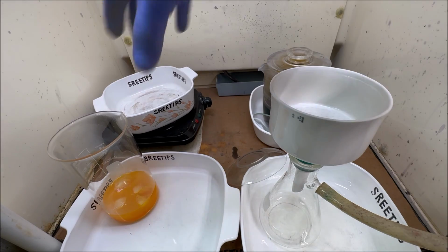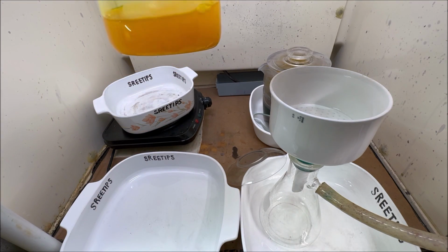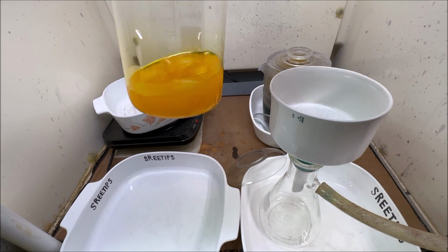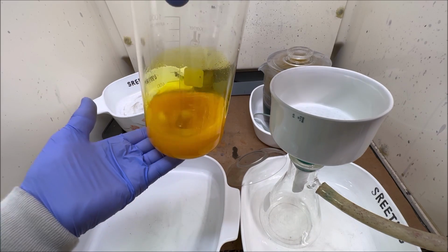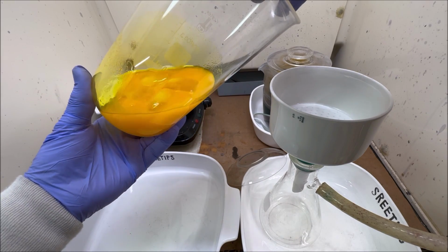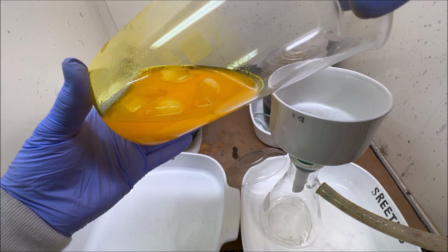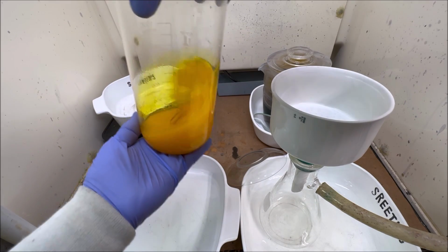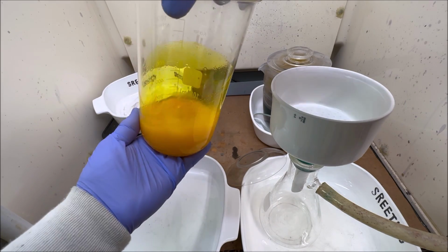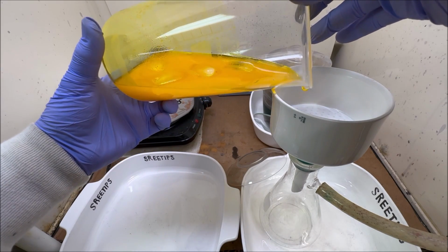Get this poured through a filter. You see there's a bunch of junk down in there. Not sure what that is. Not sure that's associated with the lead or not. I think it is. I haven't put any sulfuric acid in here yet. Now let's see what we get out of this.